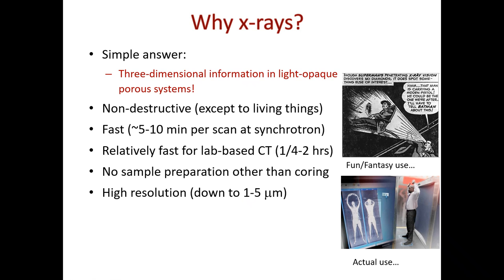So even if I can go to nanometer resolution, it's extremely hard to work with such small sizes. Handling those is difficult, and other than that, you can't do even a micron scale. When I'm imaging at a micron scale and I have several millimeters, I can arrange a core carefully, but it can be done. You're going to see all the sides, right? And you let them out and measure whatever it is.